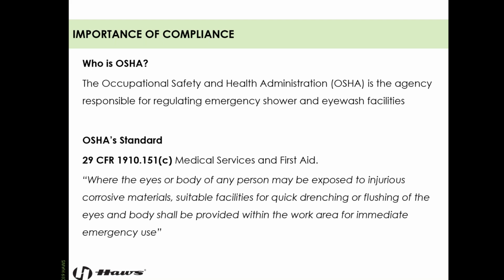You've probably had a visit, which is a good thing, right? Because they're there to help us. They're there to spot things that we may not be thinking about and improve our health and safety culture. But OSHA's standard for emergency shower and eyewash facilities is 29 CFR 1910.151(c).